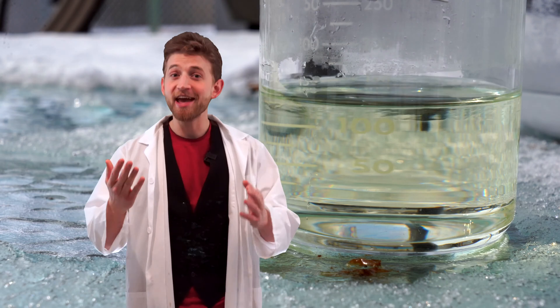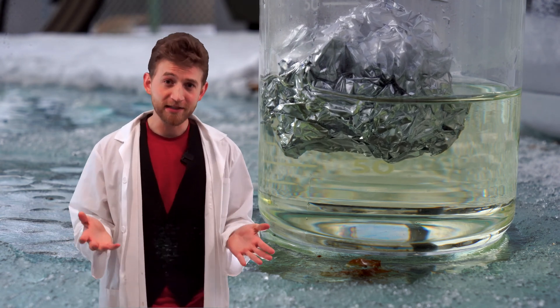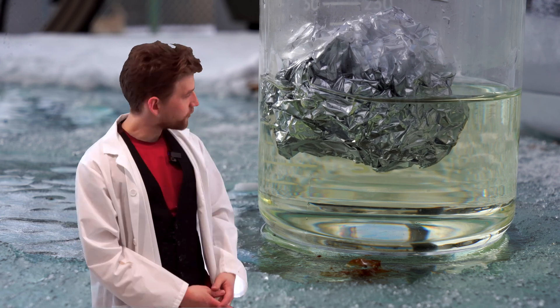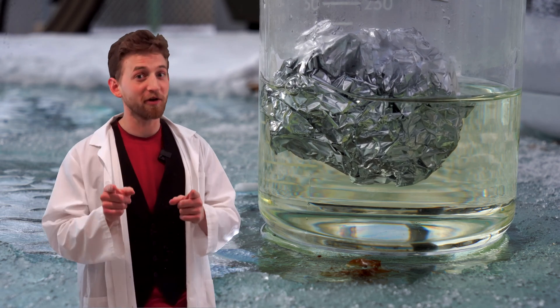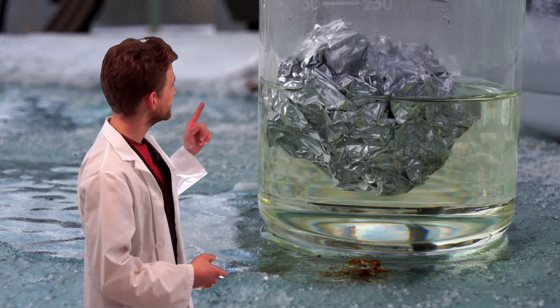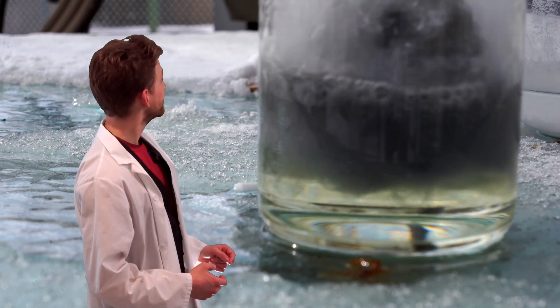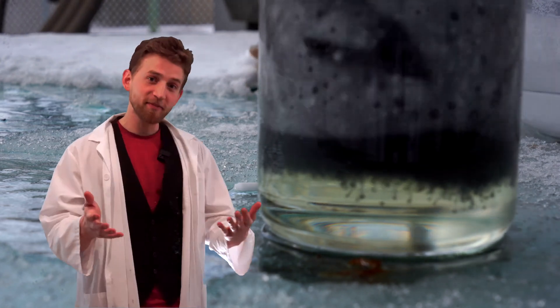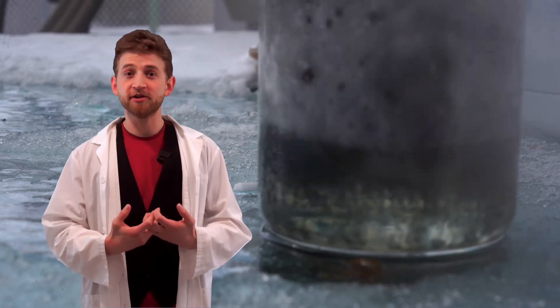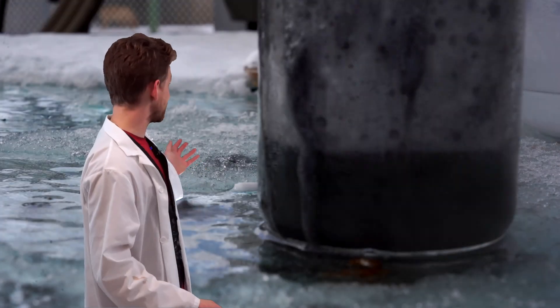Before I pour anything directly onto my skin, let me show you exactly what hydrochloric acid can do. I've got some hydrochloric acid here and some aluminum foil. Aluminum, being a metal, is typically more durable and tougher than your skin. But watch what happens when we mix them together. This reaction takes a little bit of time to get going, but when it does, it's worth the wait. And there it goes — hokey smokes, that's impressive! What's happening is the aluminum and the hydrochloric acid are reacting to create aqueous aluminum chloride and hydrogen gas — a lot of hydrogen gas.